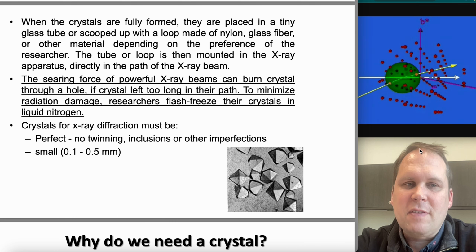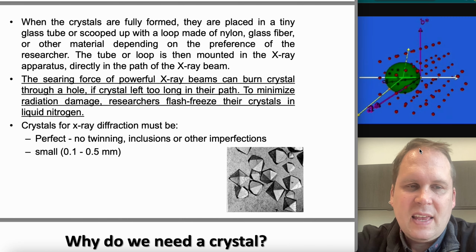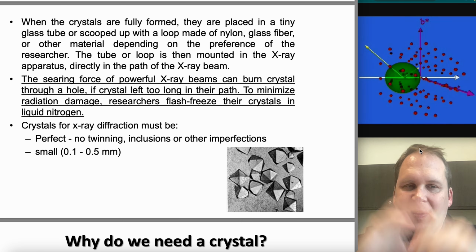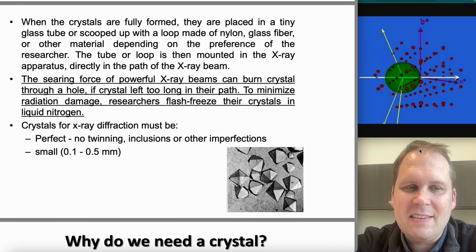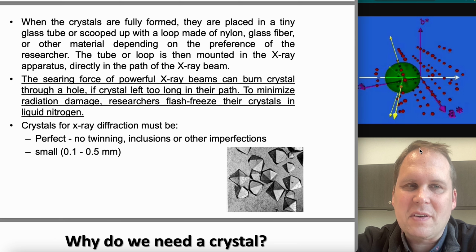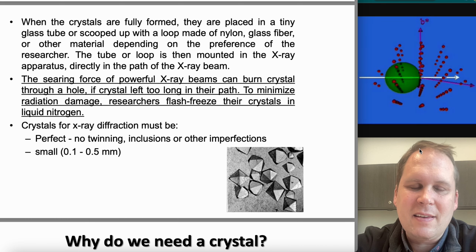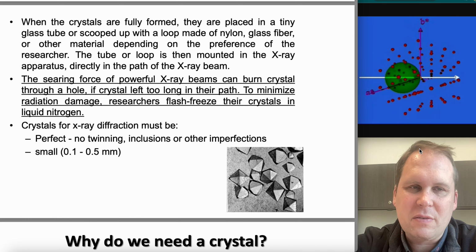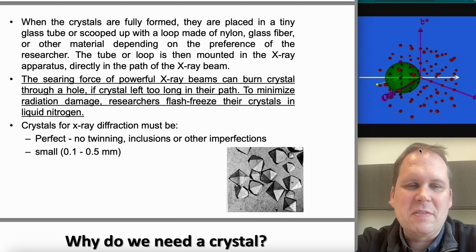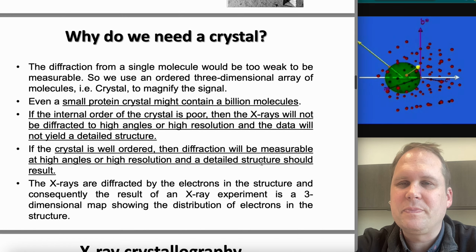And then from the diffraction pattern of the crystal, you can basically reconstruct what one unit of that crystal, one asymmetric unit, like one protein or clump of proteins, looks like, where all the atoms are in there if you do it right. So it's pretty neat. You do that in what's called Fourier space, the Fourier transformation, which is essentially a way of simulating what's happening between the interaction of the X-rays and the atoms.